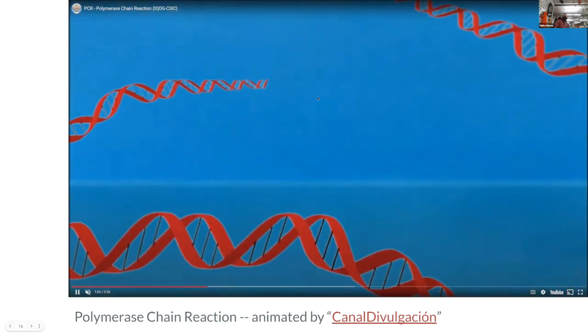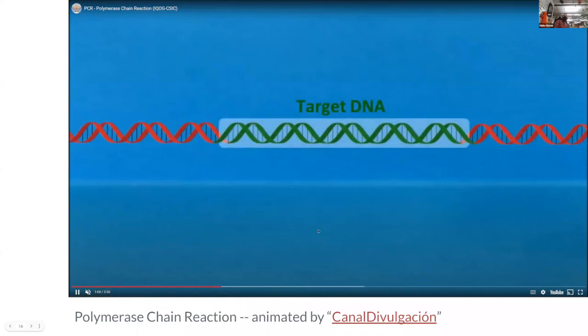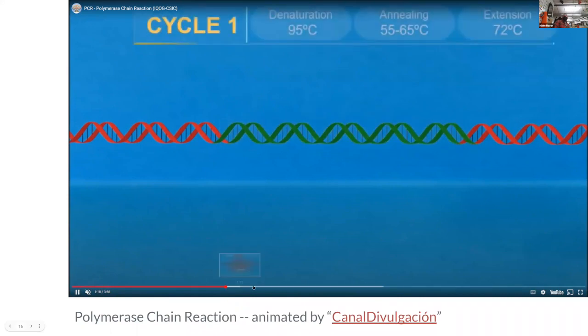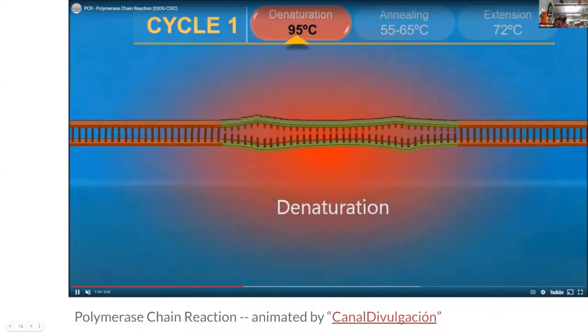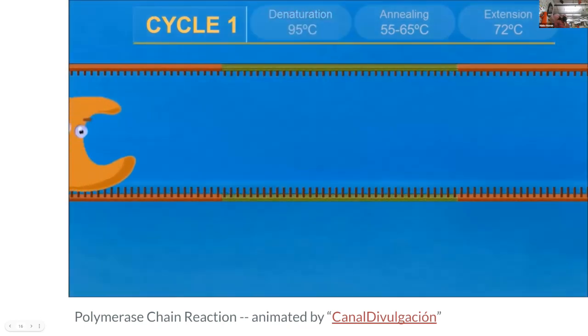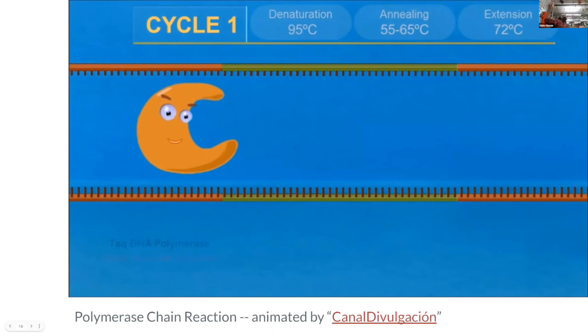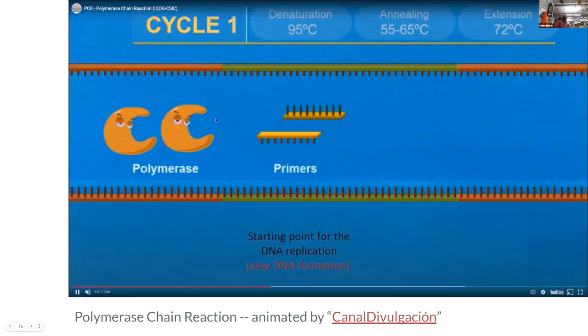Inside of there, you'll have these little DNA strands. And basically, what'll happen is it will unzip, it'll find your target DNA. And from there, in cycle 1, it's going to go through and you'll denature it. So you'll take it apart by the denaturing. Just by heating it up, it'll separate out the 2 strands. And so we do this where it heats it up. And then the polymerase, that's the polymerase stuff, it'll sort of hook on to the end of the target DNA.